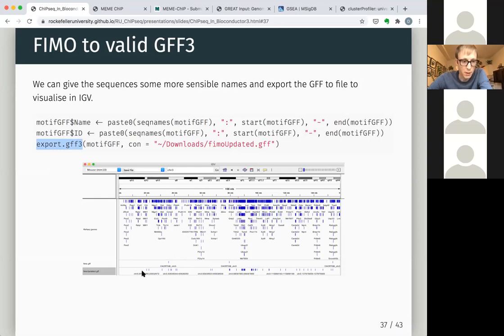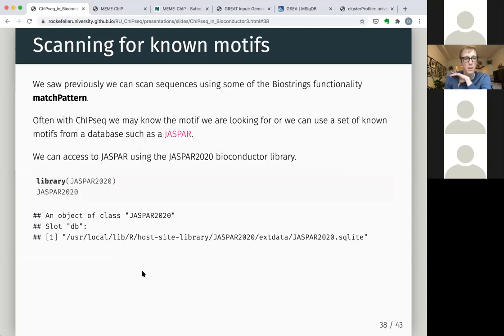So this is showing us just where the motifs are. This isn't necessarily the MYC motif or the Max motif. This is the actual motifs that MemeChip found for us. So we can see where they are. We can zoom into our favorite gene and see if the gene that we're interested in actually has one near it, or whether a certain peak we're interested in has one of these motifs. And so it allows you to explore the data a little bit.